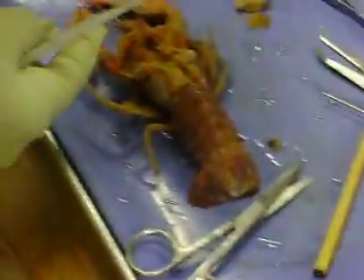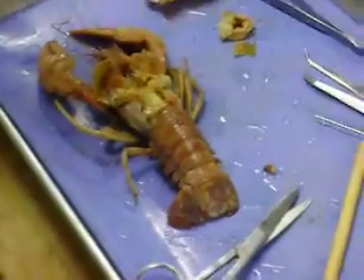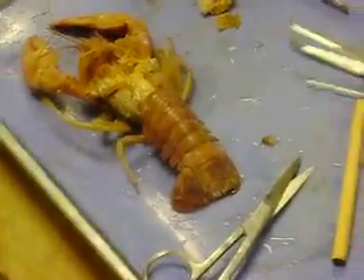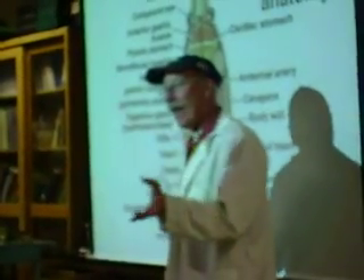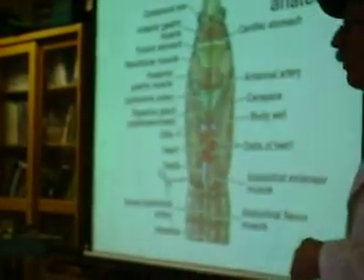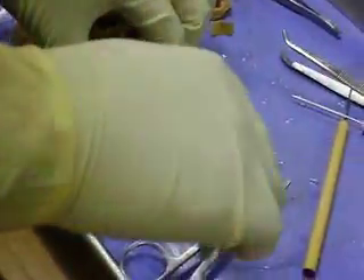On this back, you'll hear something — occasionally people say we're going to de-bean our lobster or shrimp. It's not a bean, it's a blood vessel — the artery and the digestive tract. The digestive tract runs on the back; it'll be black, probably filled with food, maybe with another little artery you can see on top. Once you pull that out, you should be able to see the abdominal flexor muscle.